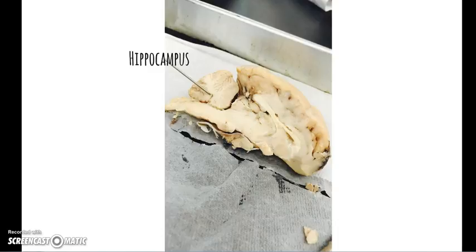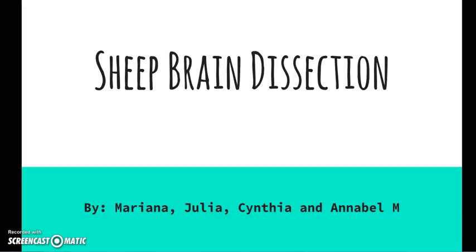Here's the hippocampus. It is located within the brain's medial temporal lobe. It works with memory, specifically long-term memory. And this concludes our sheep brain dissection.